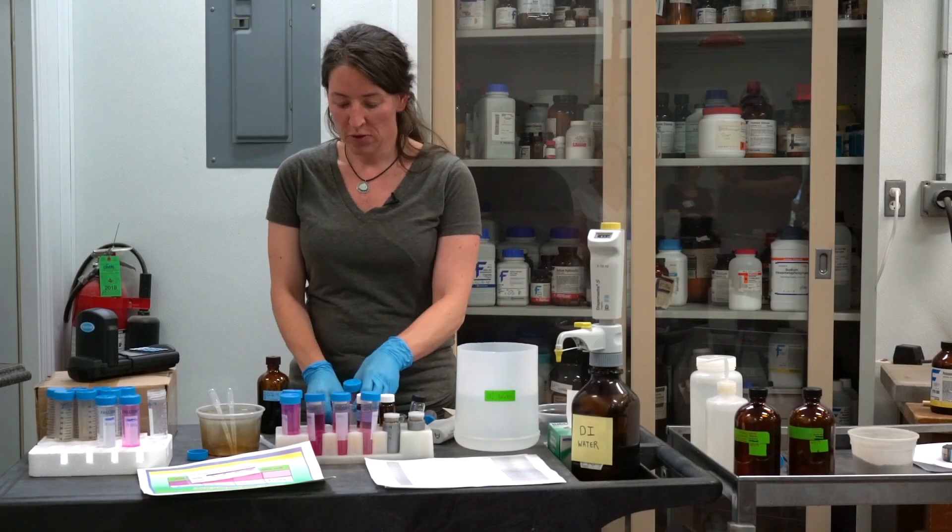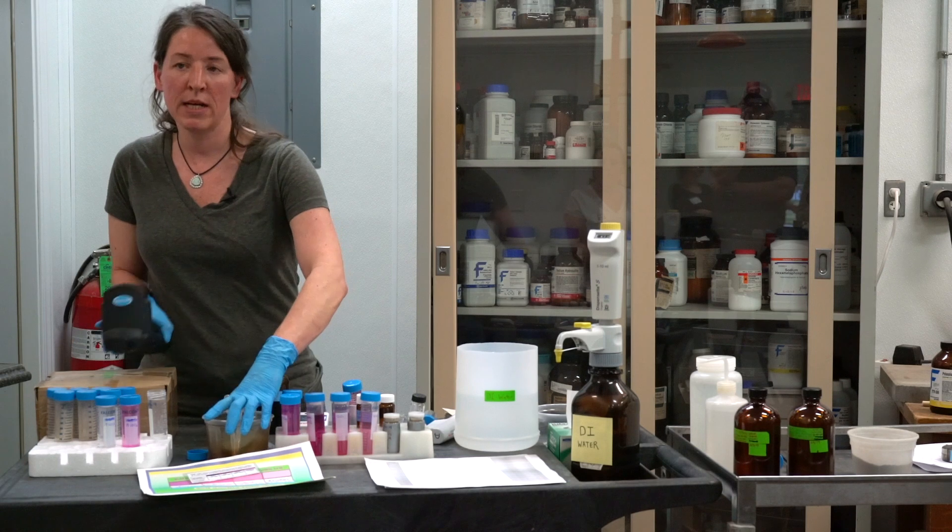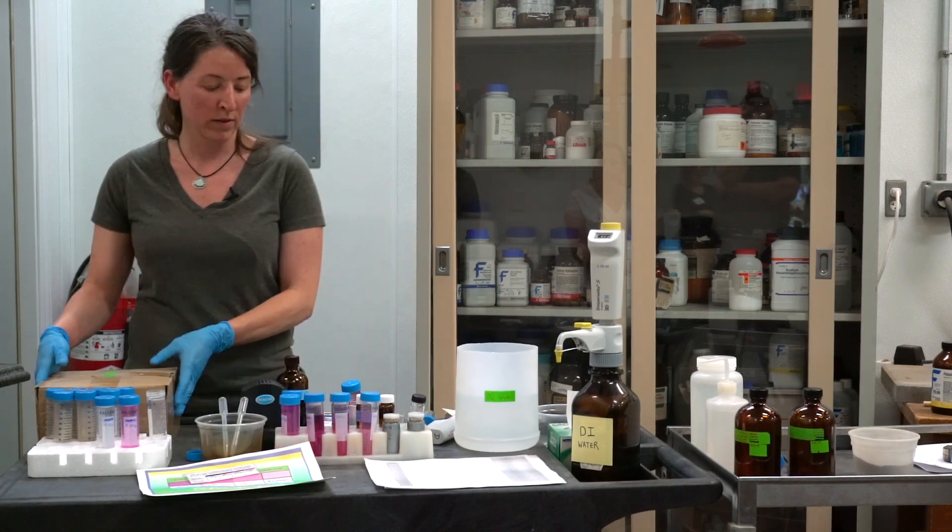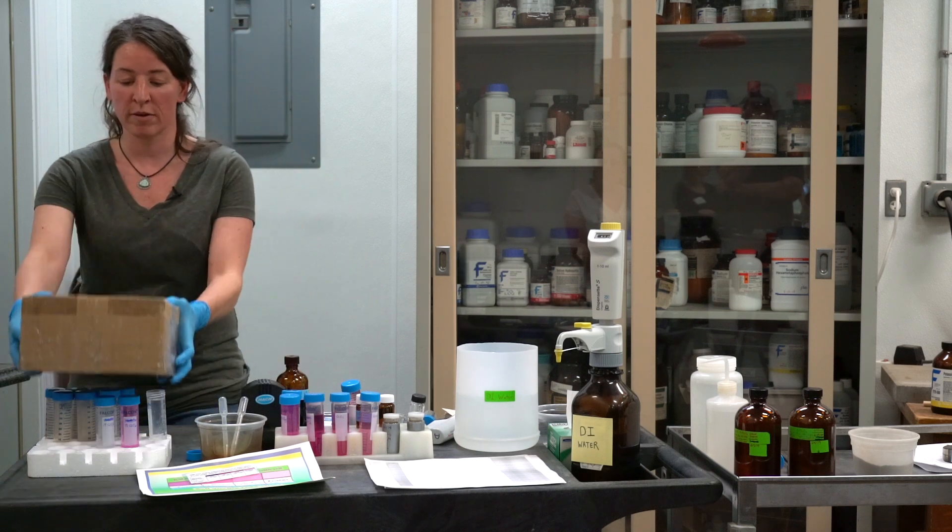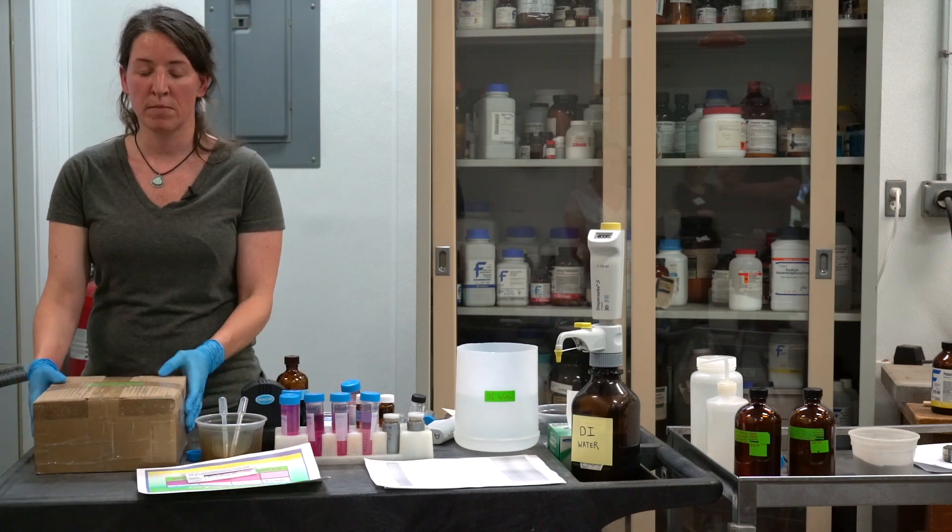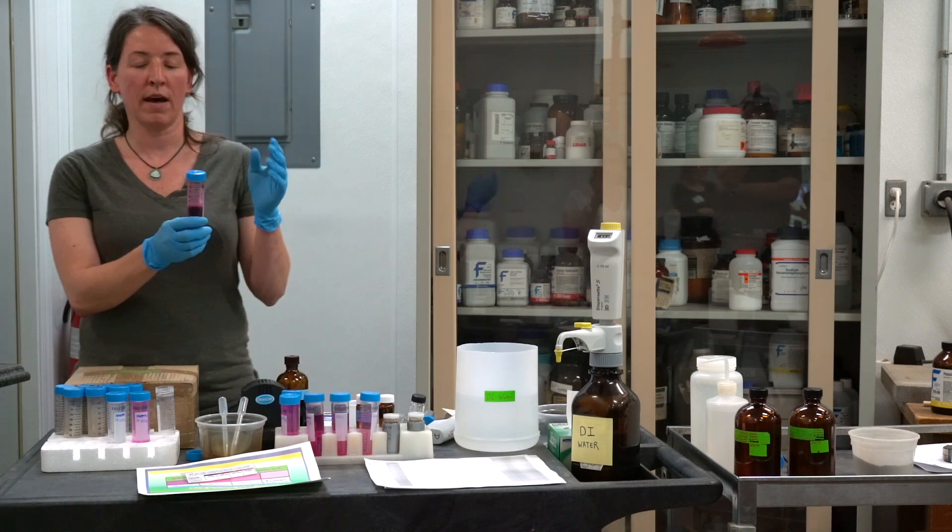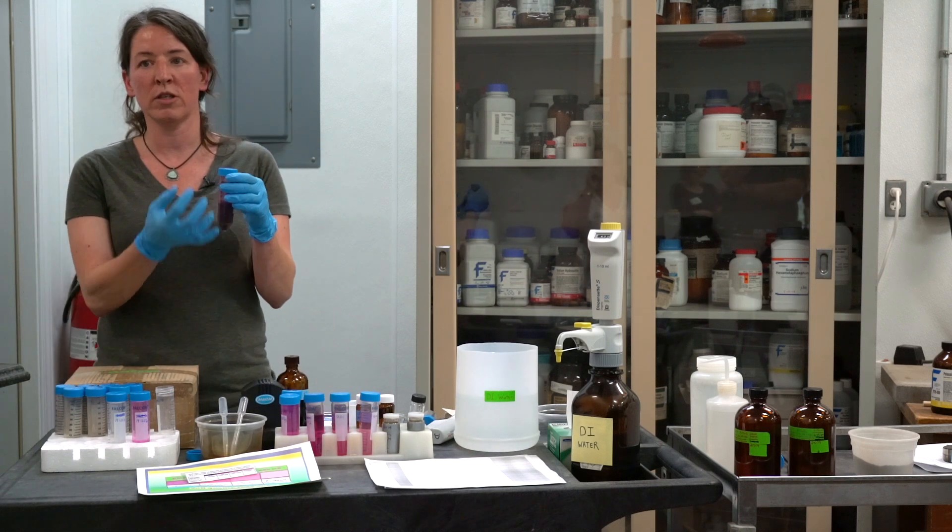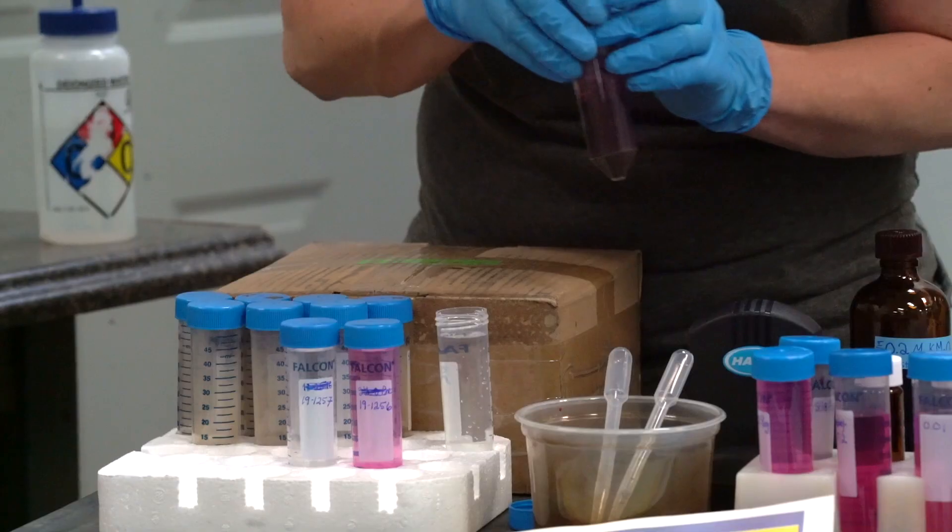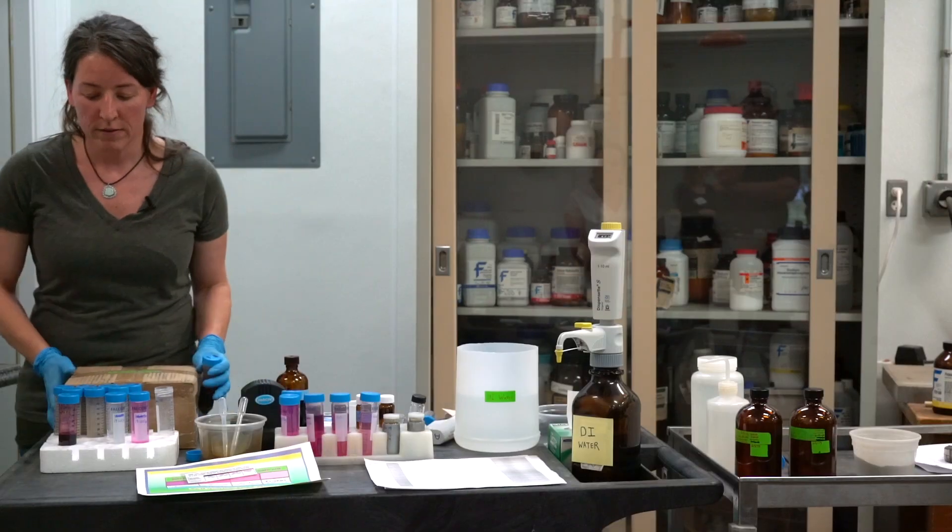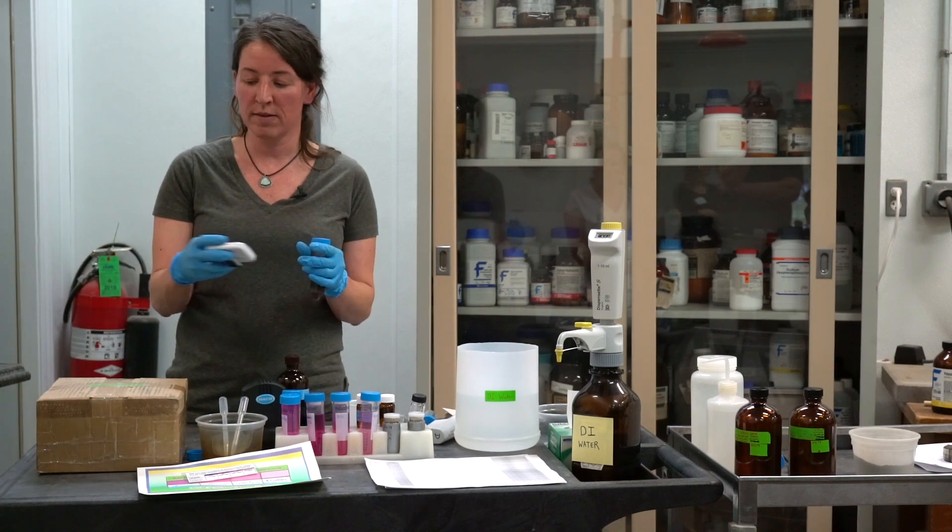Once your two minutes is up, the next is going to be a 10 minute settling time. During this period you want to protect your sample from light. We use a box here, we cover it up and it sits for 10 minutes. What's happening during the settling time is the calcium chloride that we added to the solution is flocculating with the soil and it'll settle out to the bottom.